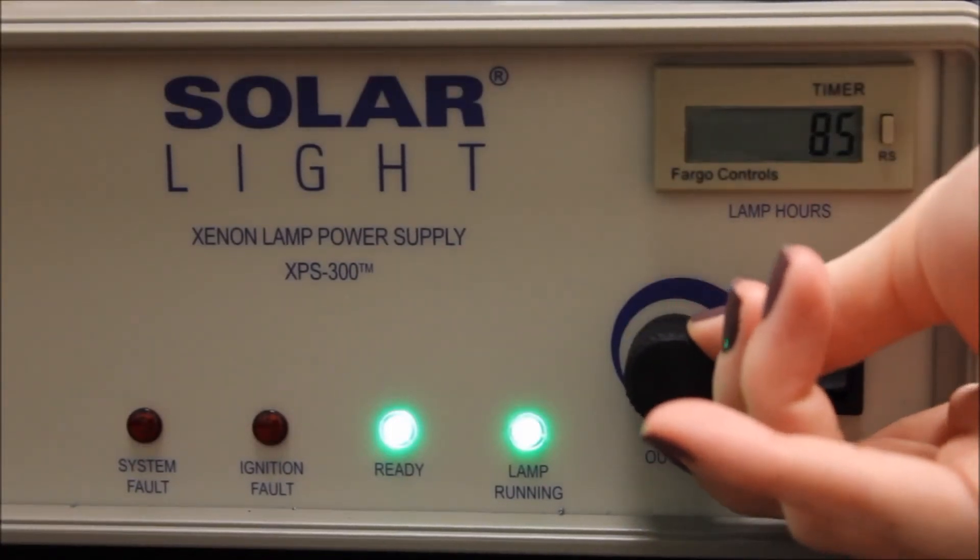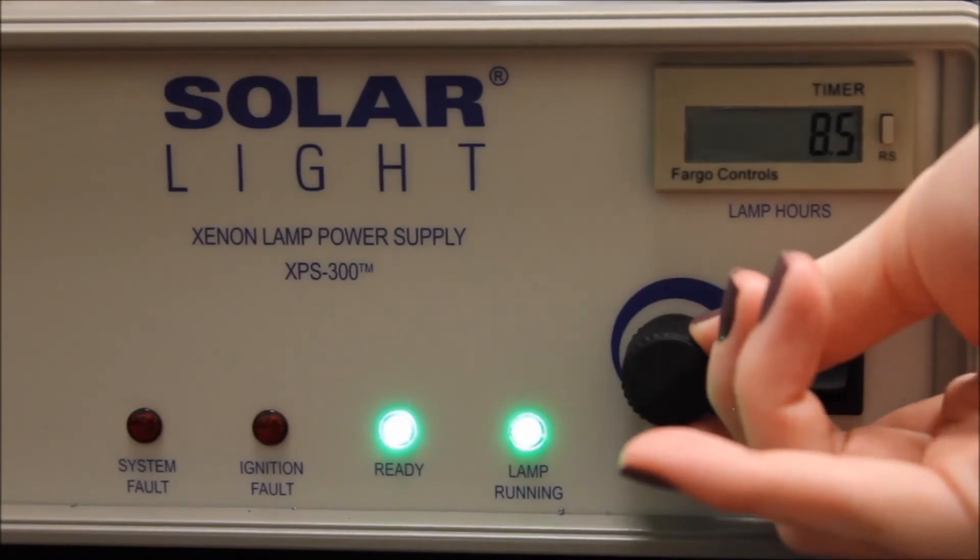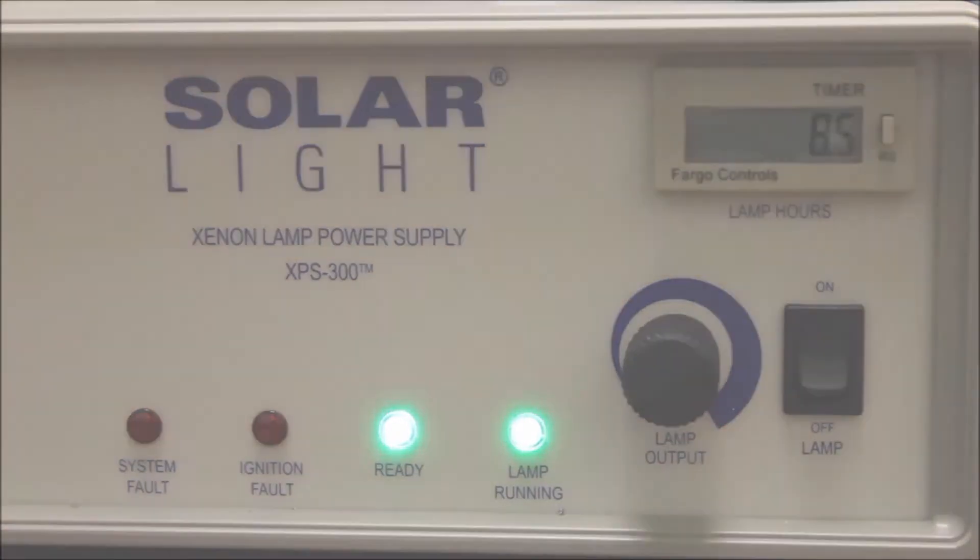The output is approximately 20 times the intensity of the sun and simulates the ultraviolet spectrum of the sun with over 90% homogeneity.